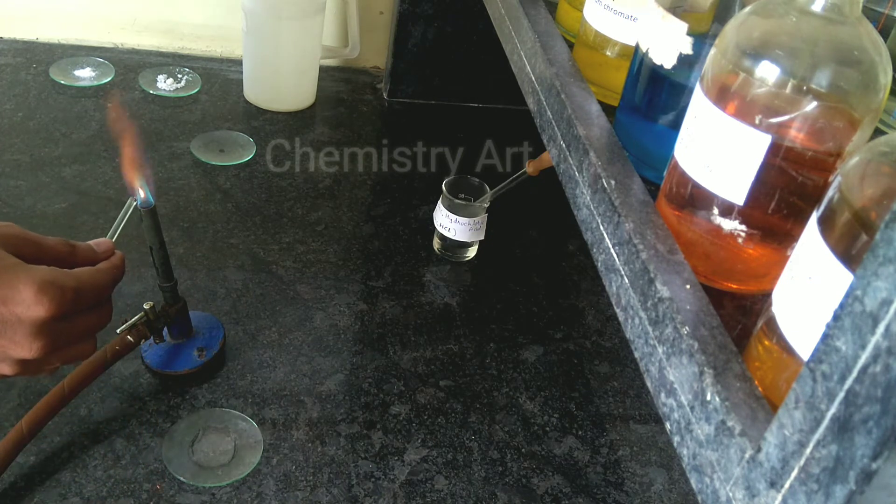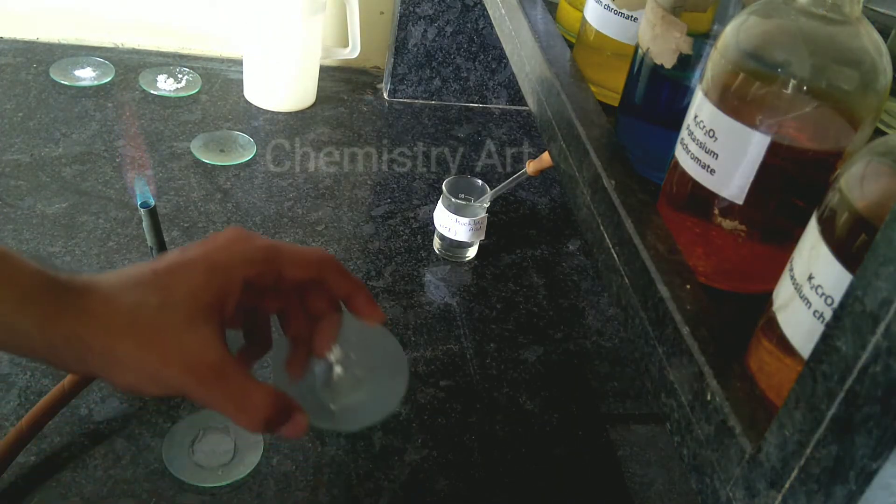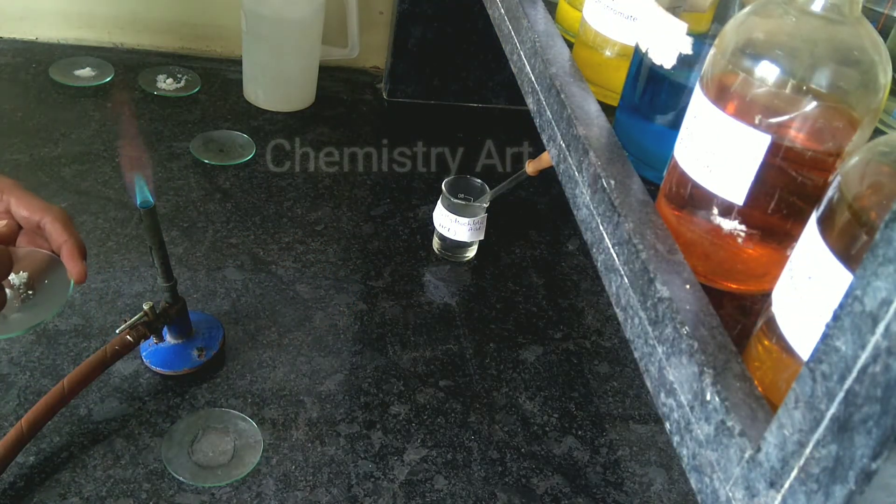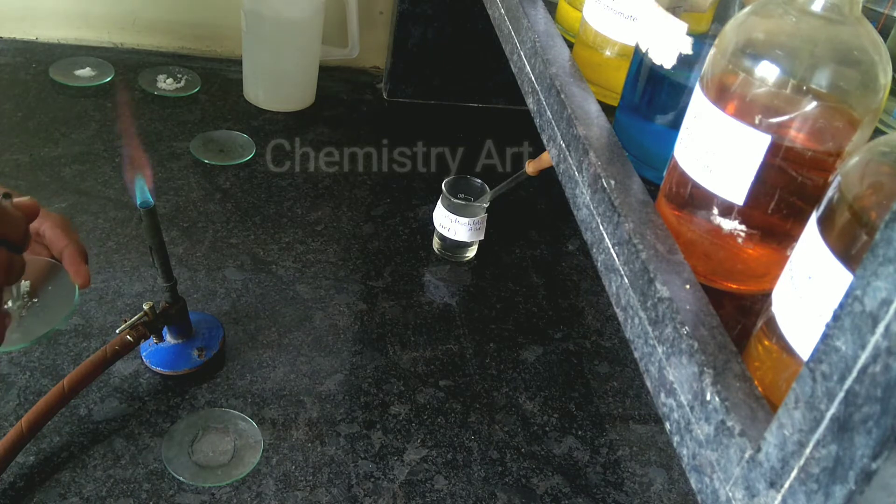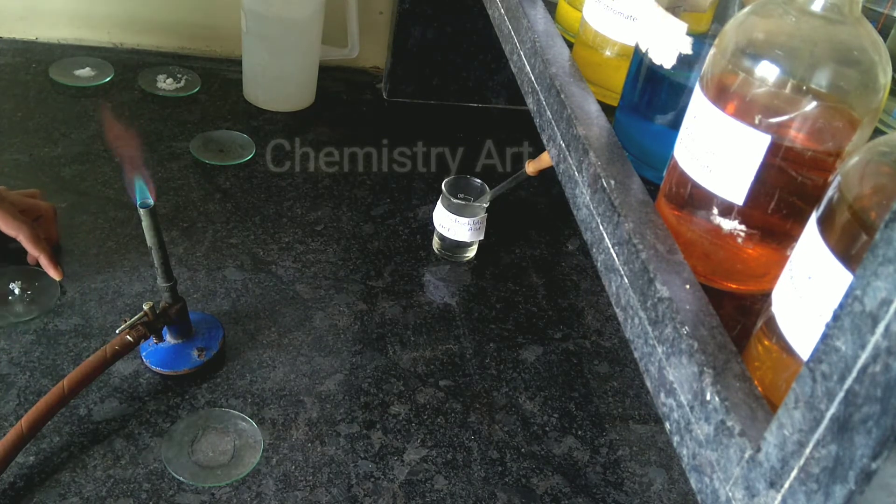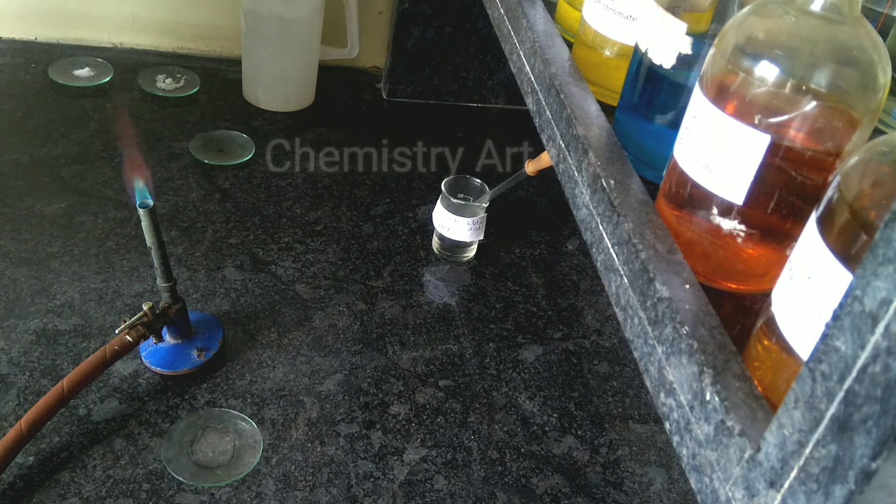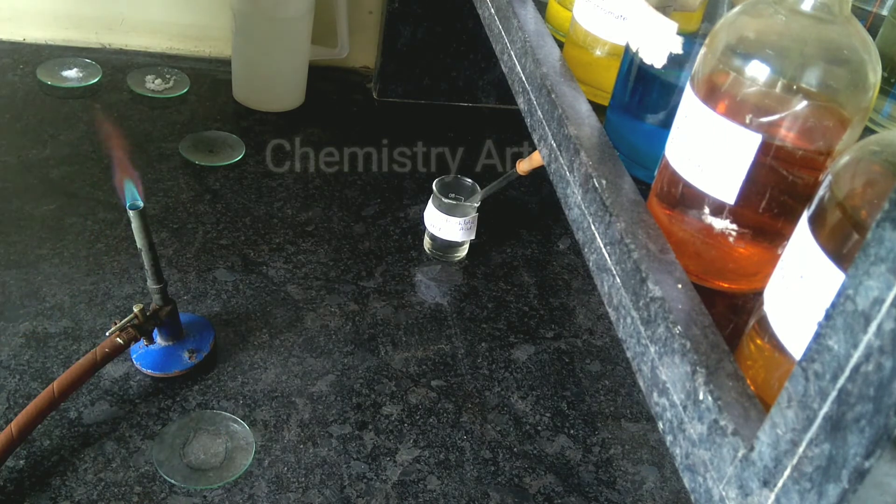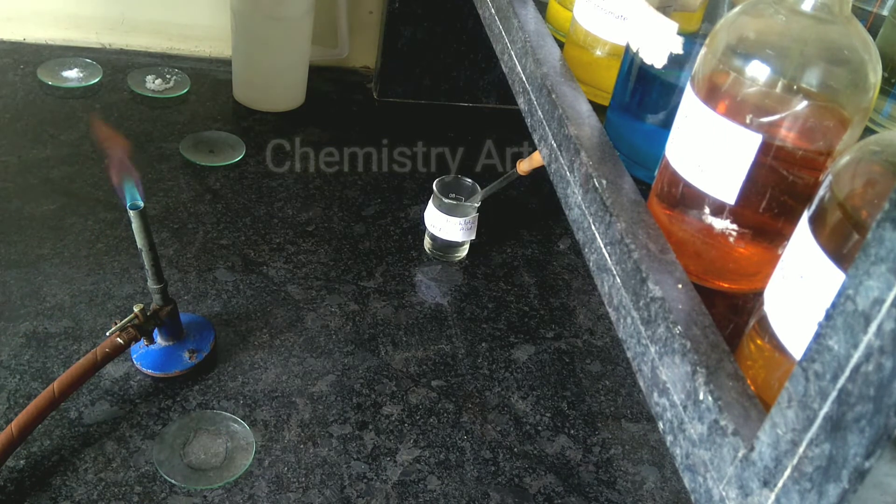As you can see, I am cleaning the platinum wire. Now I will take a very small amount of my paste of the salt on the loop of the platinum wire, and then we need to heat it. Here you can see the color, you can see the red color.